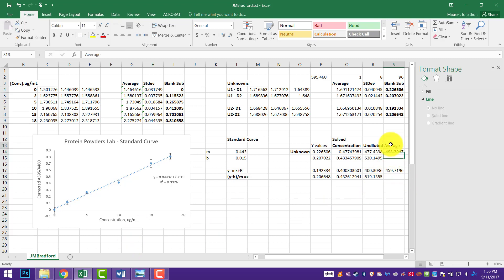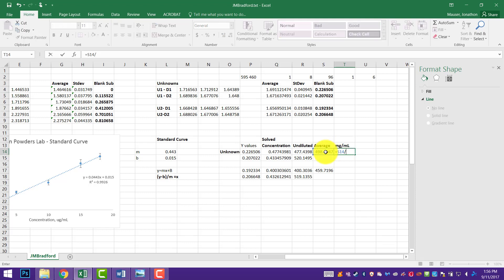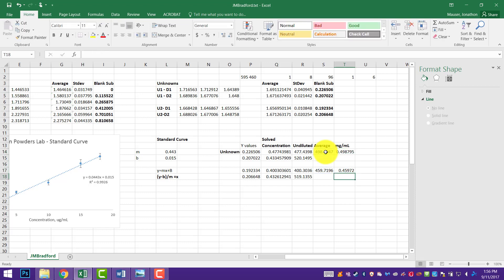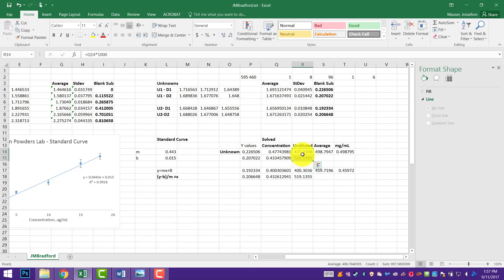Now that's in micrograms per ml. I might also like to move those into mg per ml, because that's often what we actually want to know — how many milligrams of protein are in our milliliter. That's 1,000 micrograms per ml, so we divide by 1,000. You can see that our two samples are around 0.45 mg per ml. So for every ml there's about 0.4 milligrams, or 400 micrograms. We now report those values.